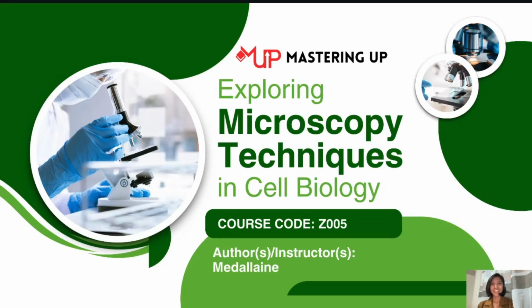Good morning. Today, we're going to take a deep dive into a fascinating tool used by scientists to explore the invisible world of cells. This tool is microscopy, which allows us to see things that are too small to be seen with our eyes. Without microscopes, we wouldn't know much about the tiny world inside our bodies or other living organisms. We'll look at different types of microscopes that scientists use to study cells and understand how they help to discover things that change our world.